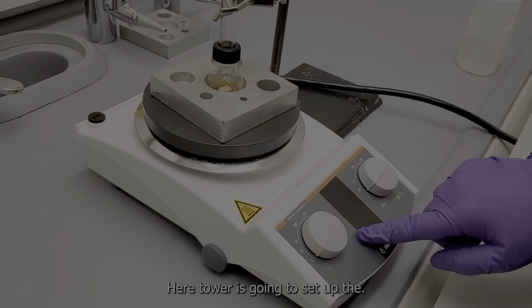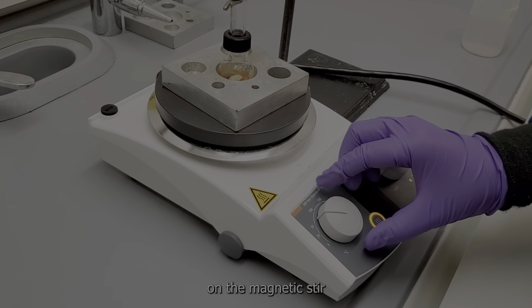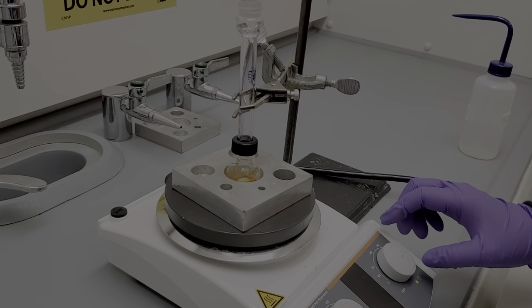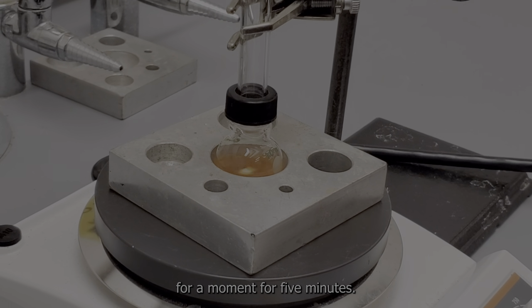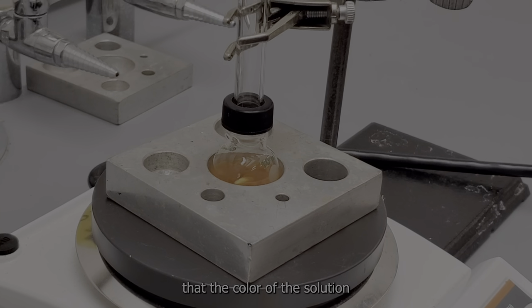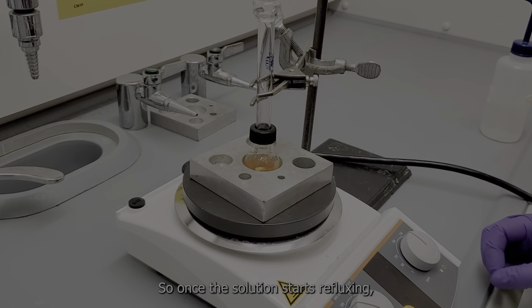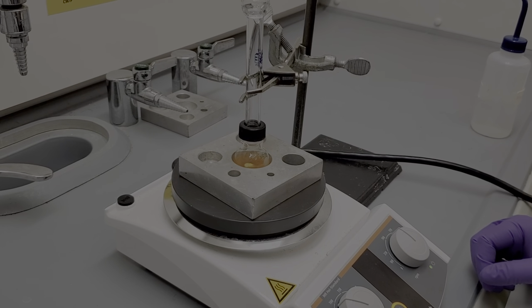Here, Tara is going to set up the reaction by putting on the magnetic stirrer as well as the heat in order to reflux the ethanol. She's going to reflux with stirring for 5 minutes. It's important to note that the color of the solution should turn from red to yellow during this time period. So once the solution starts refluxing, that is when you consider the start of your 5 minutes.